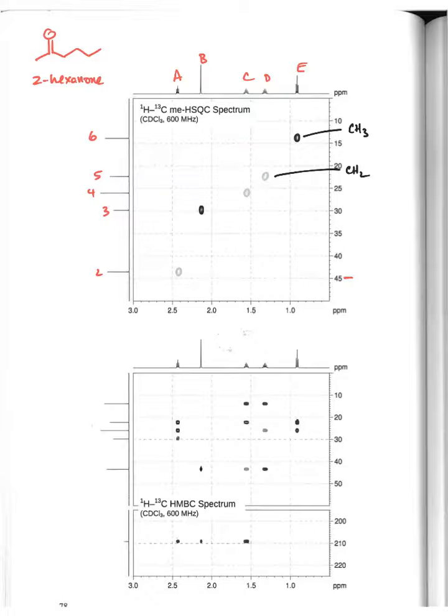And what this spectrum is telling us is the actual assignment of the proton bonded to that direct carbon. So if we're reading this way, we hit peak A, we come down, we see that it's bonded to a CH2 group, and that's carbon 2.